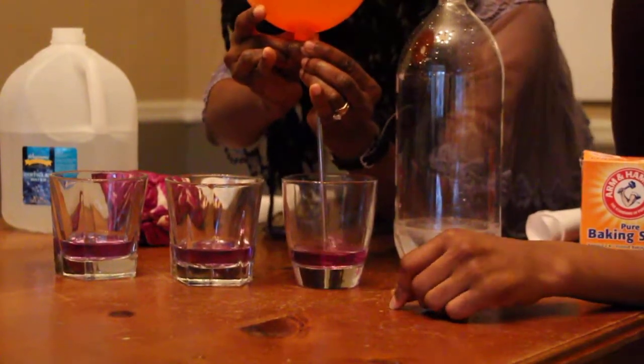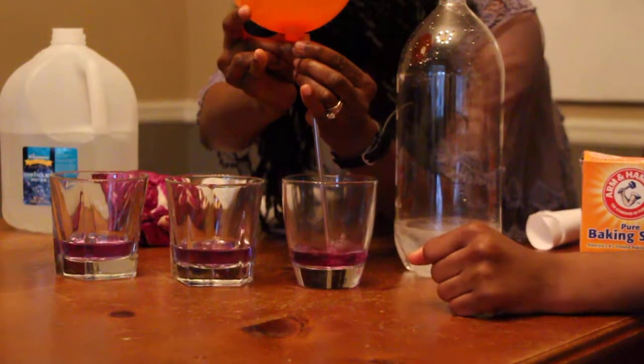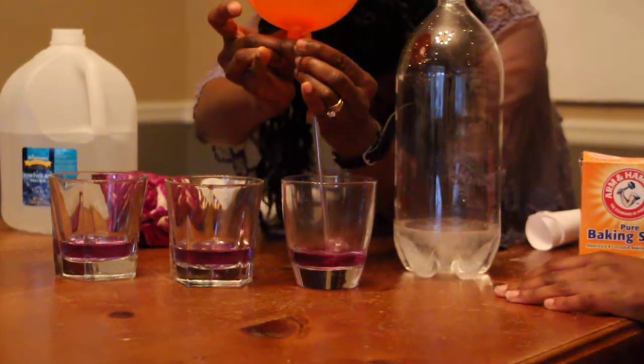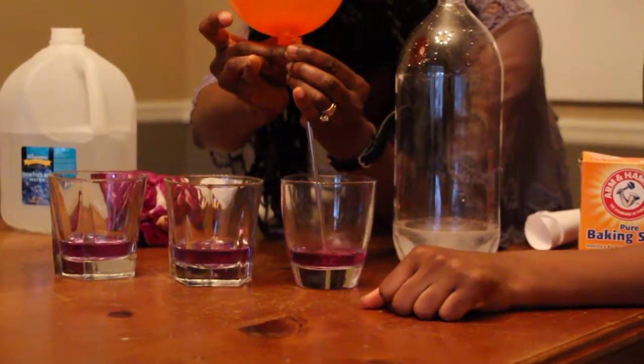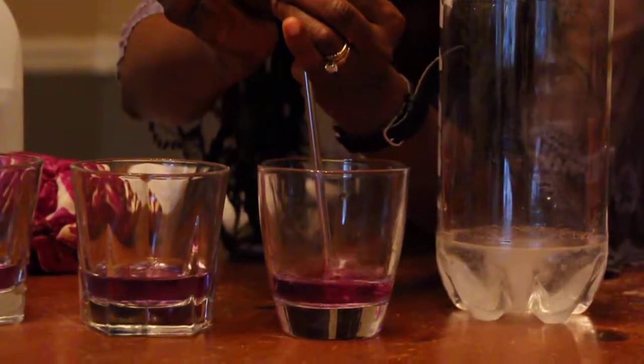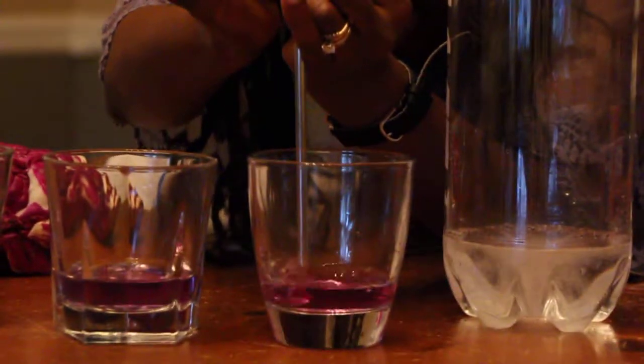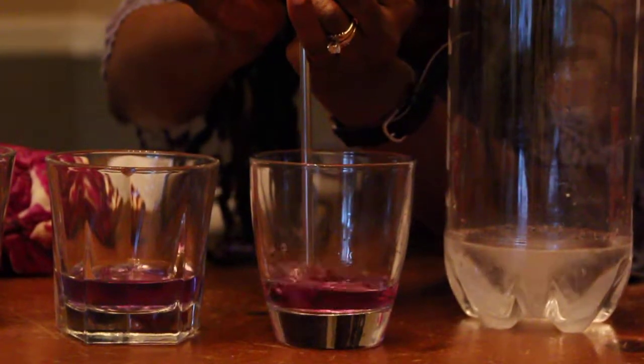We're hoping for a color change. Coming out of somewhere else.